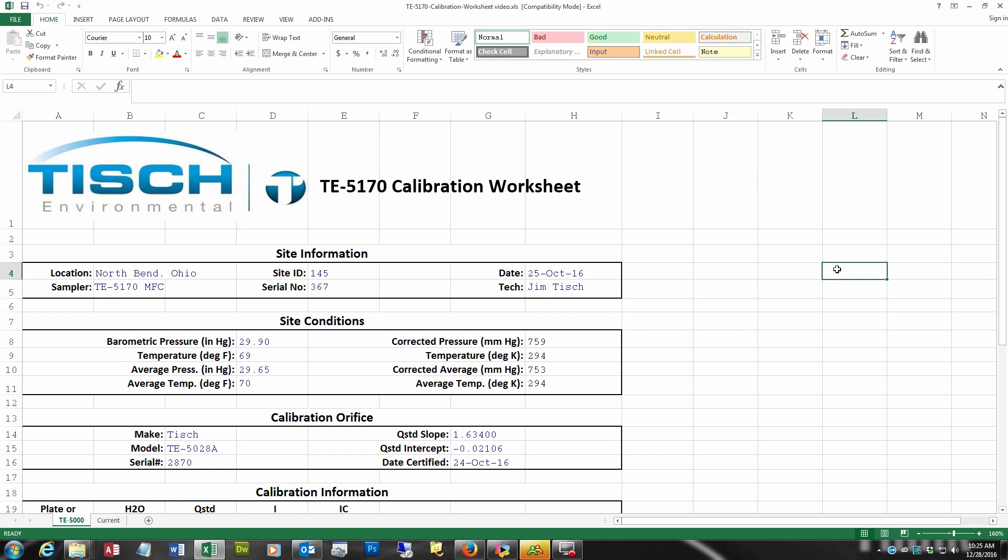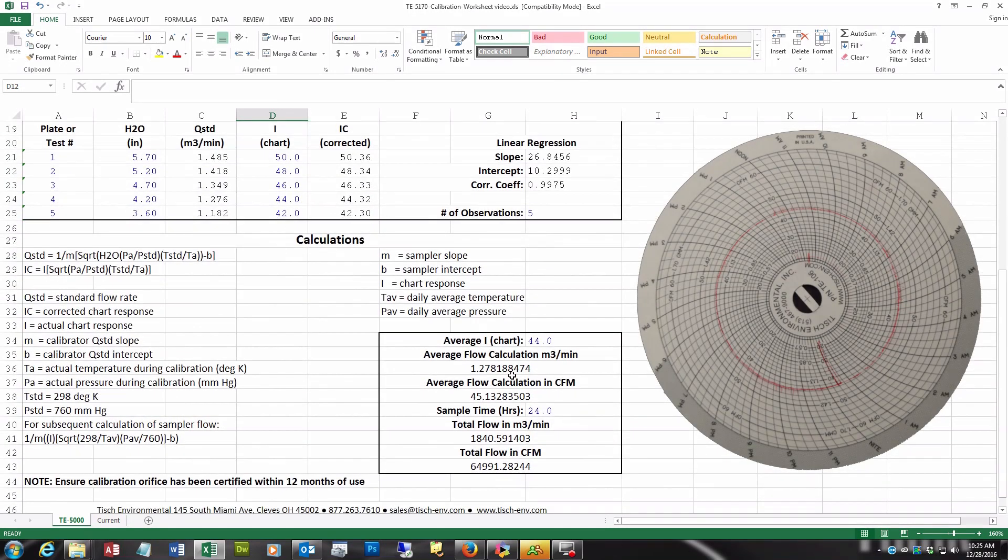After collecting the dirty filter and the chart, you will need to go back to the calibration worksheet. The average pressure in inches of mercury was 29.50 in the 24-hour period that the filter was running. The average temperature in degrees Fahrenheit was 55. Looking at the chart, you can see that the pen line was between 44 and 42, so we will use an average chart reading of 43. It ran 24 hours. The total flow in cubic meters was 1,786.20 and the total flow in cubic feet was 63,070.84.